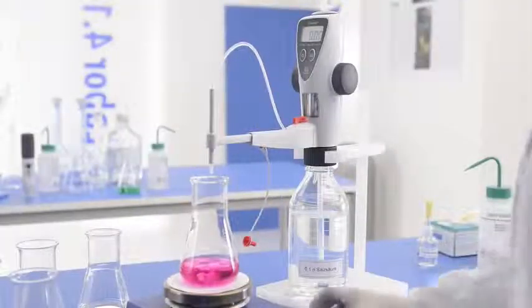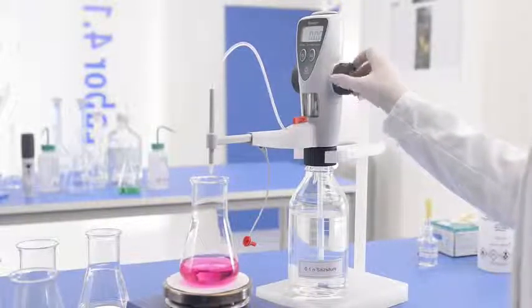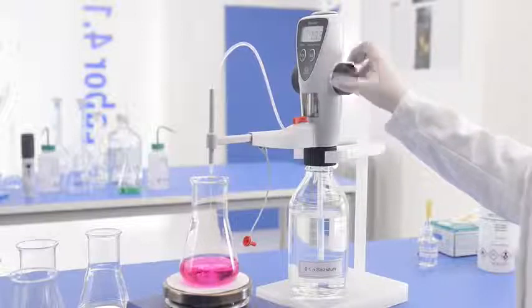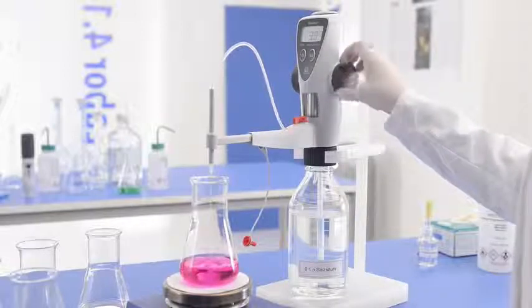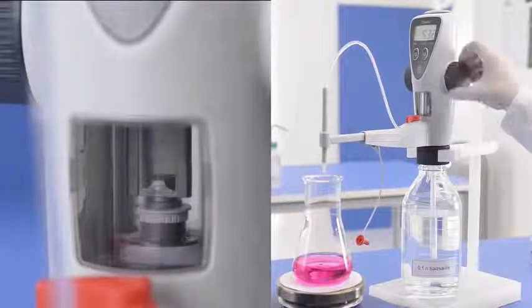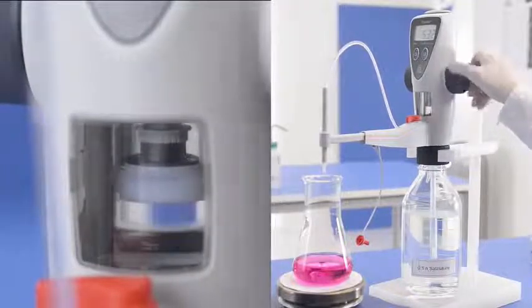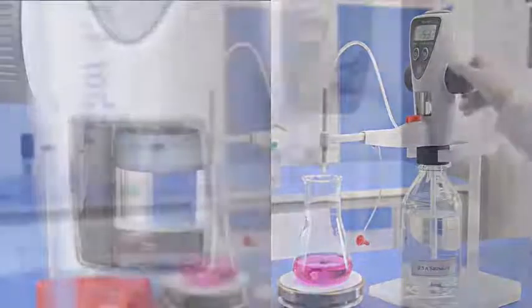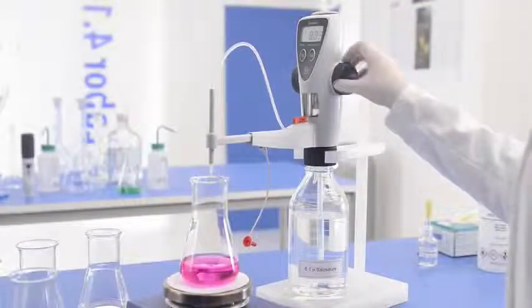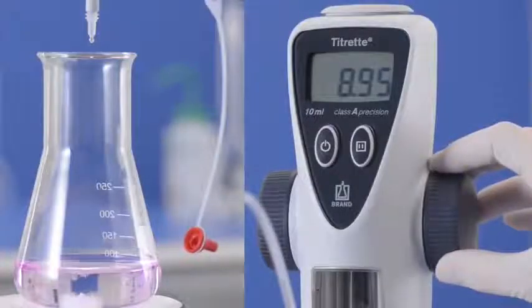If the titration is started without a full refill, as shown here, the piston may reach the stop before the end point. In this case, simply raise the piston for filling. The display value will remain fixed during the filling process. The titration can then continue as usual, drop by drop, with the highest possible precision.